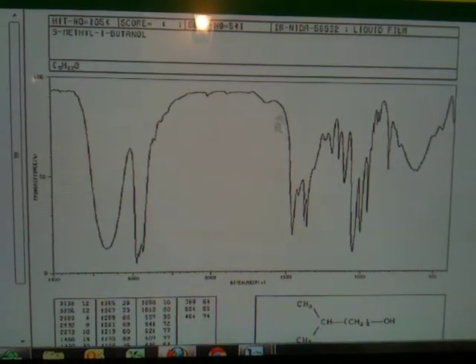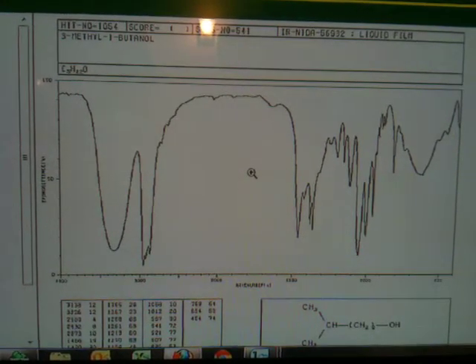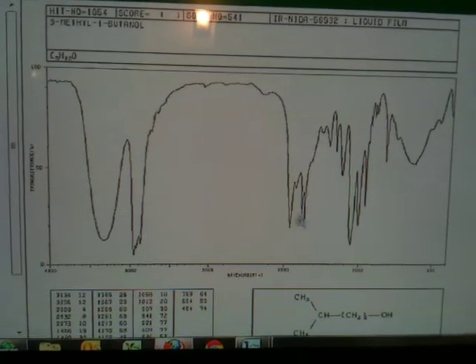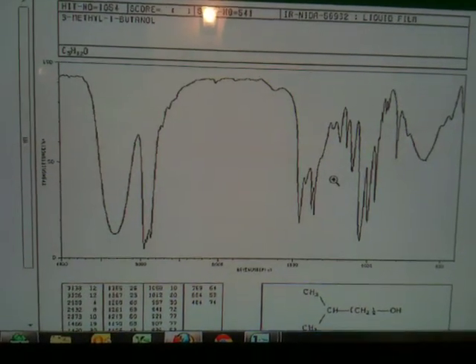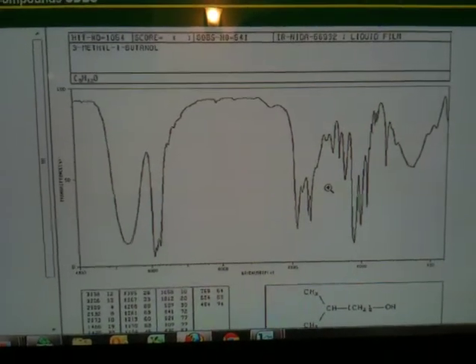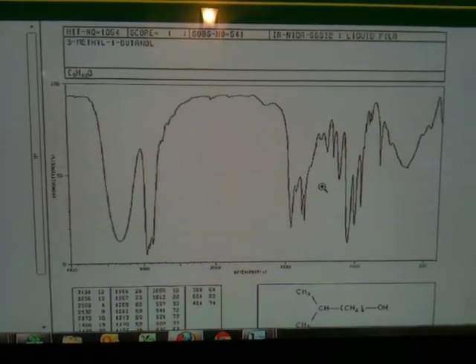So when you think you've got the right compound, you can look it up here and you'll find it should be an exact match. Not a little bit, an exact match in terms of position and intensity. You kind of study the topography. But I'm not joking around. It's not a terrible exercise to look at, say, 5 alcohols and compare their spectra. Look at 5 ketones and compare their spectra. You'll find they have certain characteristics in common.